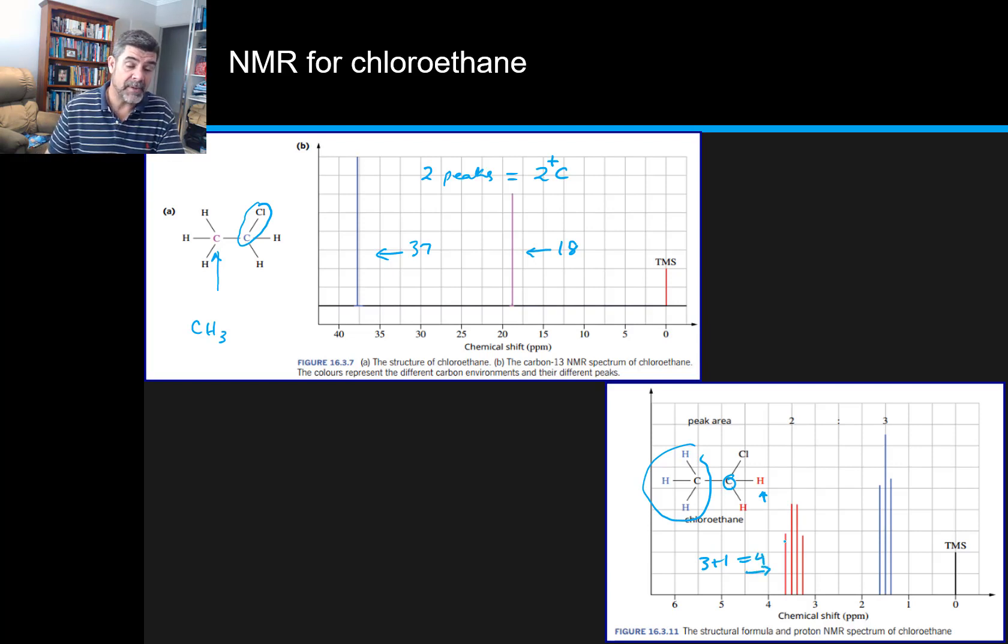And of course the other carbon has a neighbour which has two hydrogens and a chlorine, and the chlorine is not going to be part of this, but the hydrogens will. So therefore if we count the number of hydrogens over here, we have two plus one, which gives us three of these little cluster peaks all together. So that's how we can put this information together.